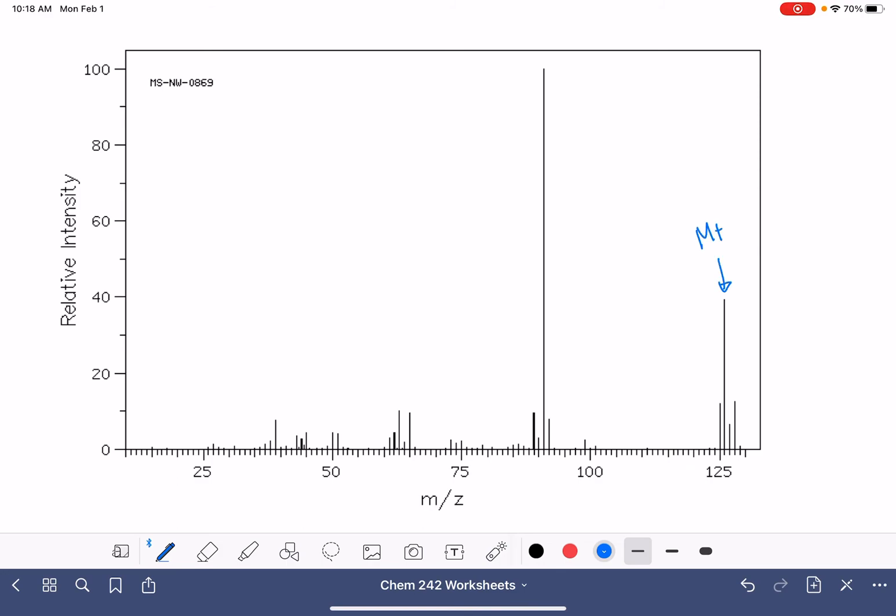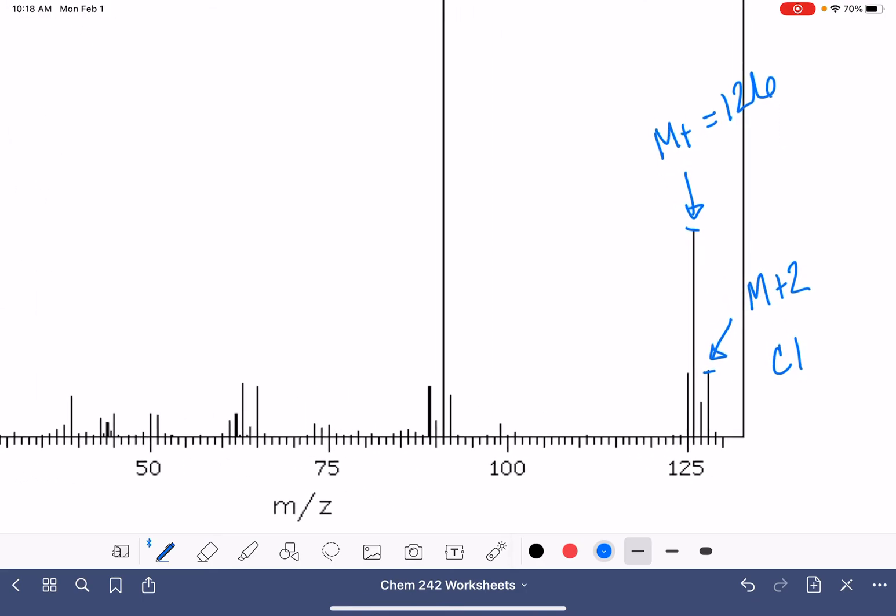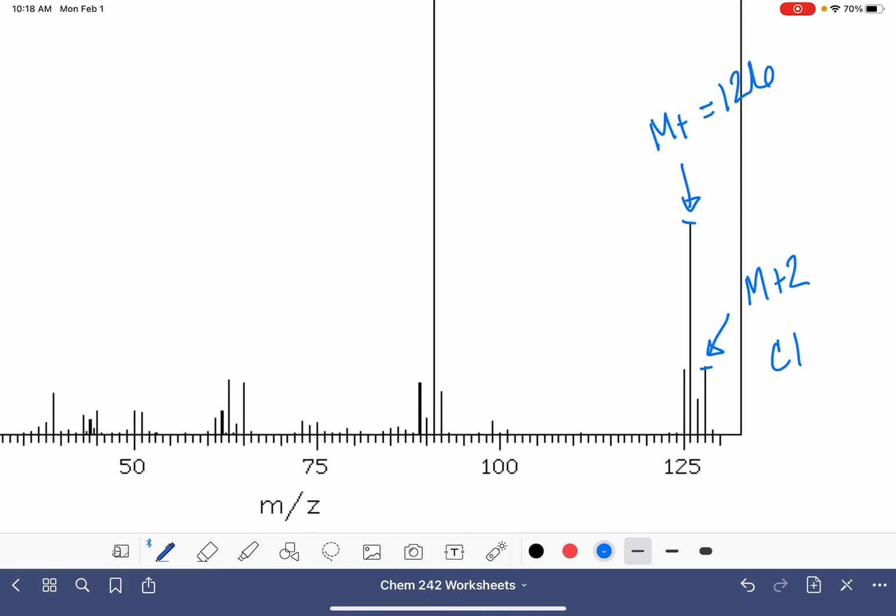And then notice we do have an M plus two peak in this spectrum. And the relative height of the M plus and the M plus two peak tells us that we have chlorine in the molecule. The M plus peak is at 126 right there.